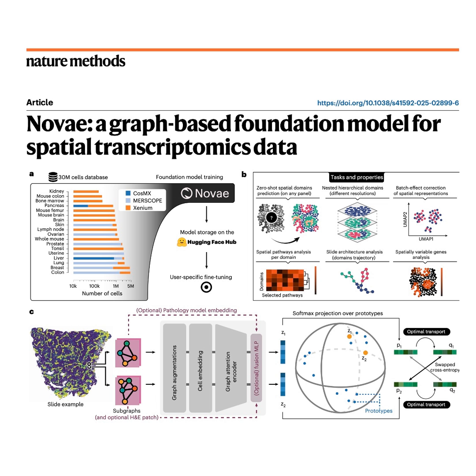Wait, like a biological translator? Exactly that. Think of it this way. Novae isn't reading the individual words, the genes. It's identifying the underlying biological programs or concepts that they represent. It keeps it all consistent using L2 normalization, which just ensures the weights are comparable even if one slide has 10 times more measured genes than another. That is huge. It completely removes that intersection of genes problem that has plagued cross-study analysis for years.